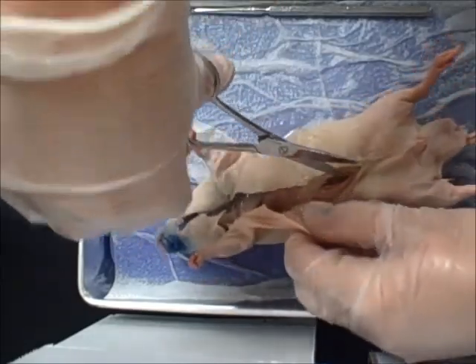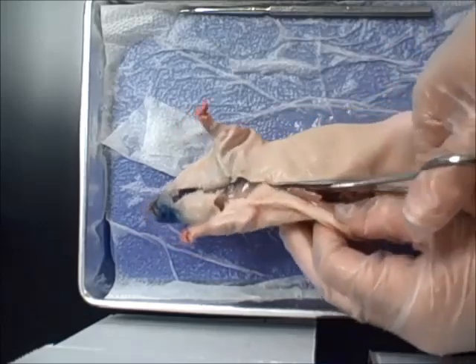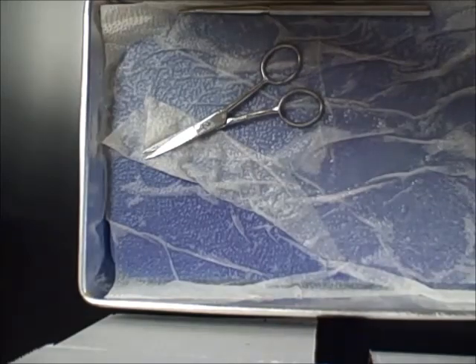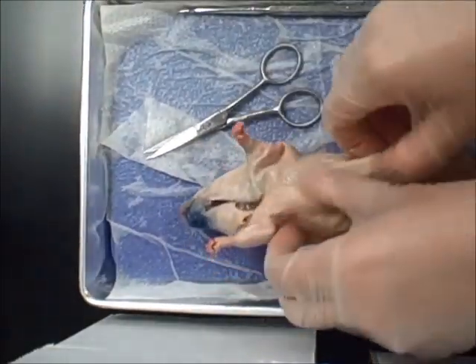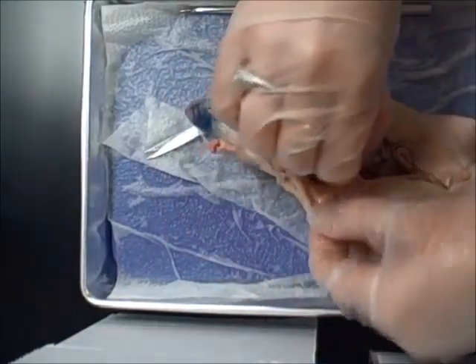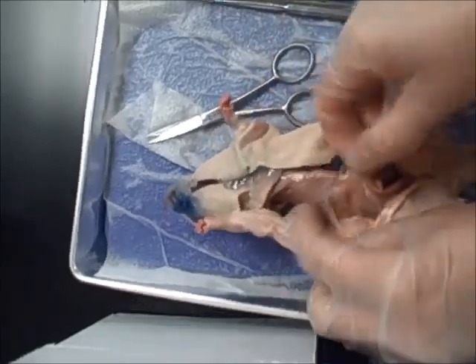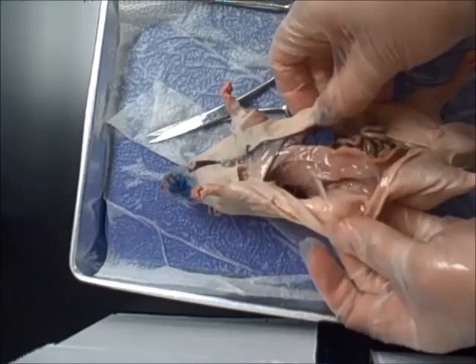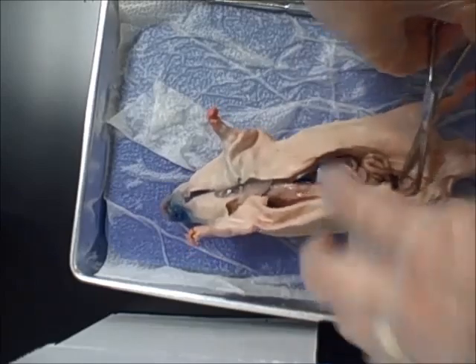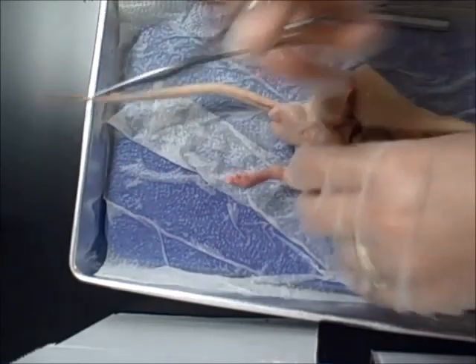Cutting down into the abdominal region. All the liquid coming out is preservative, by the way. Drain it. So you're cutting through the skin, part of the integumentary system, our largest organ of the body, and then you're also cutting through muscle that lines the entire body underneath the skin. So we're cutting through the abdominal cavity and the thoracic cavity. I'm going to keep cutting to get it open, and then we'll go through the organs.